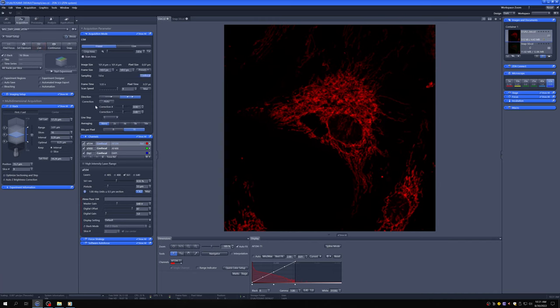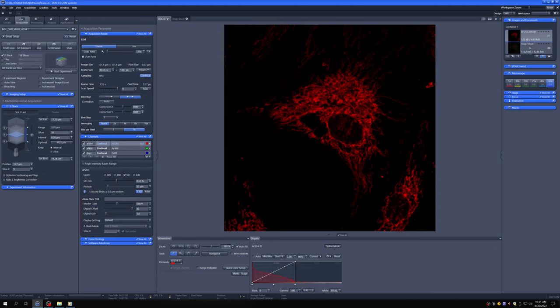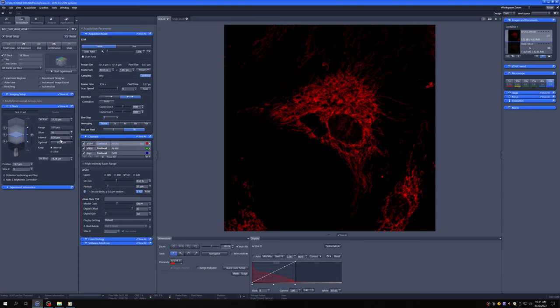So just like this has a confocal button which sets the optimal pixel size, this has an optimal button, which uses an optimal Z-step size. This one, I agree that this is a good pixel size.